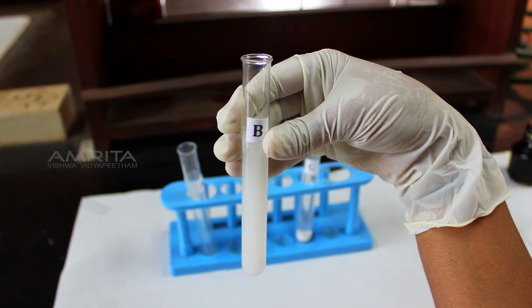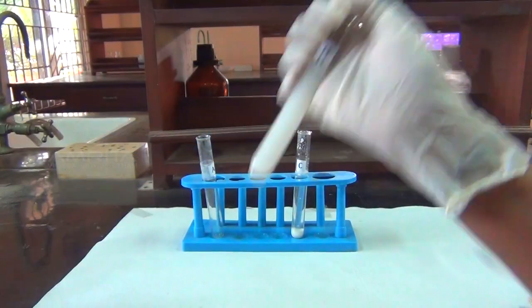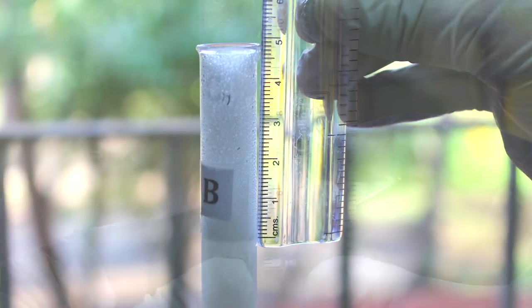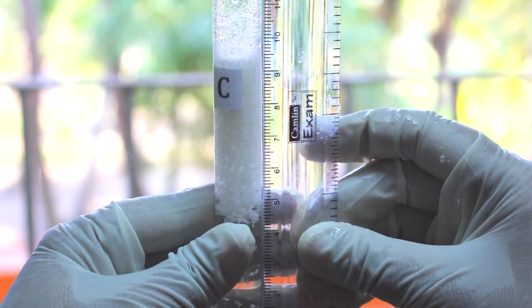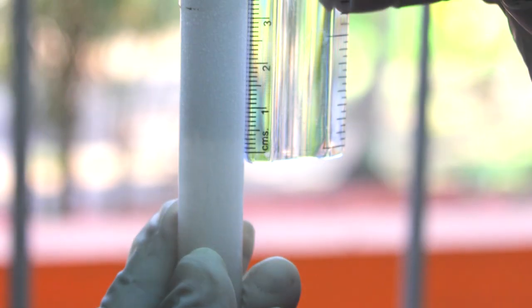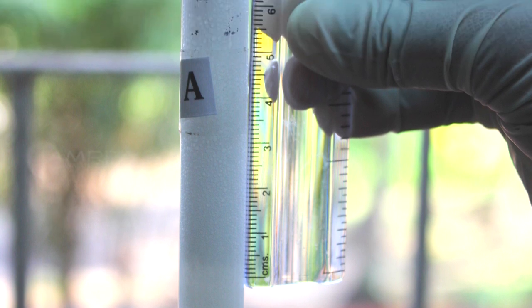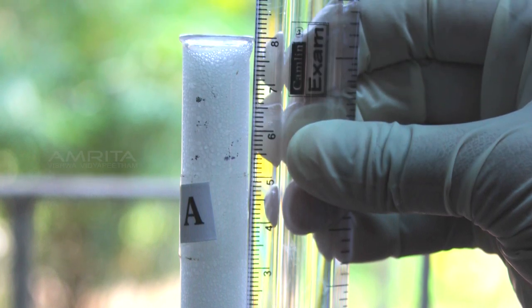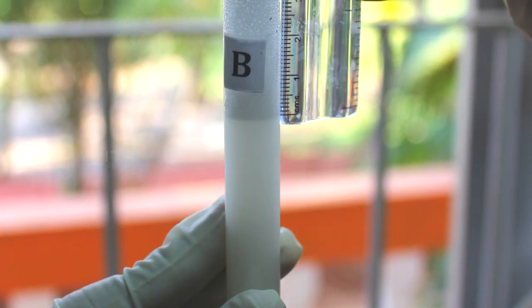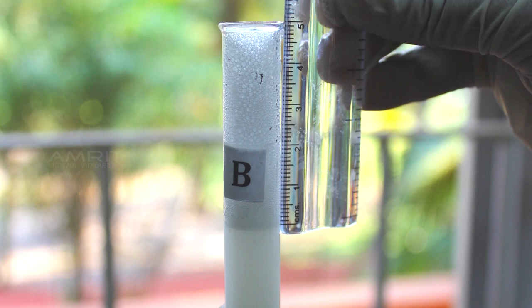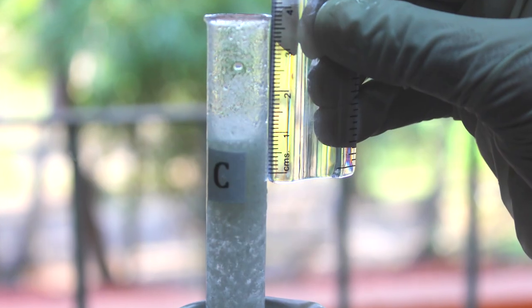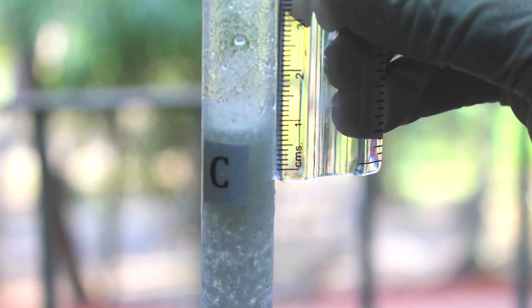Similarly, take the other two test tubes and repeat the same steps and measure the length of the foam and the final length of the soap solution. Soap solution in test tube A produces the maximum length of lather. The solution in test tube B produces a smaller length of lather and the solution in test tube C produces the minimum length of lather.